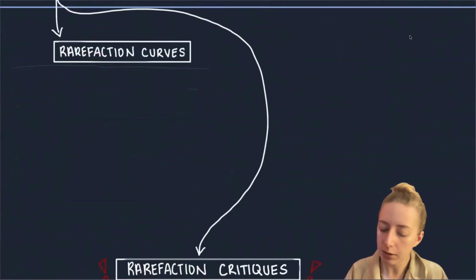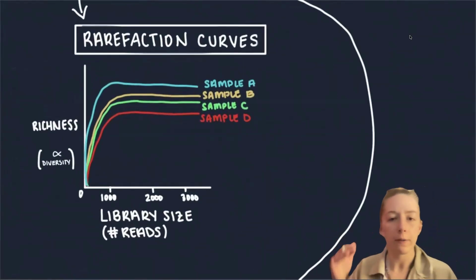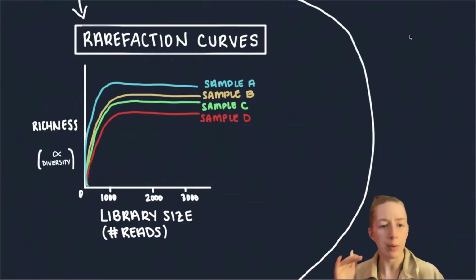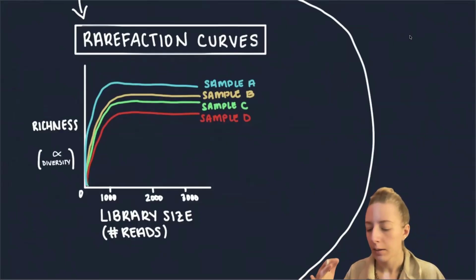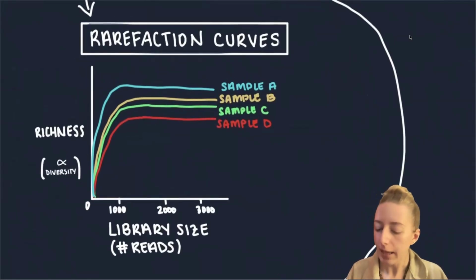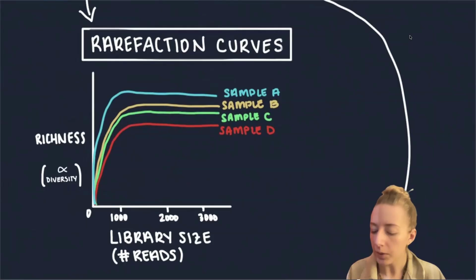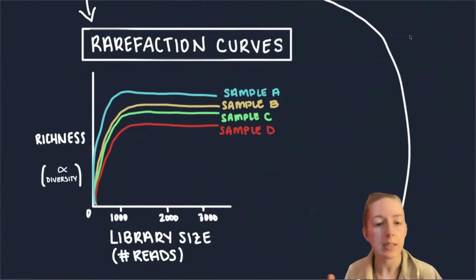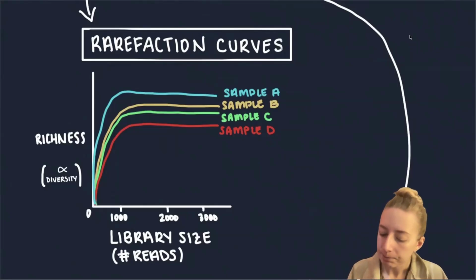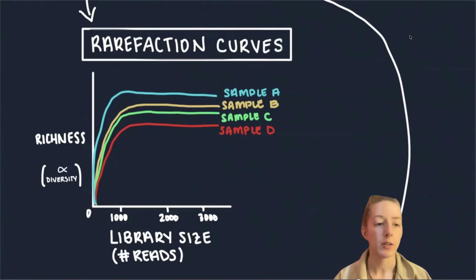And we can observe this closely too, because you might question, okay, how do I know what to rarefy down to? How do I choose the threshold of the number of reads per sample? This is something that can give us some indication. On the y-axis, we have richness, which is basically the number of ASVs found. And on the x-axis, library size, which means the number of reads or sequencing depth of the sample. So let's say we wanted to see how the depth of our sequencing relates to the richness. So how many different kinds of microbes are we detecting overall?